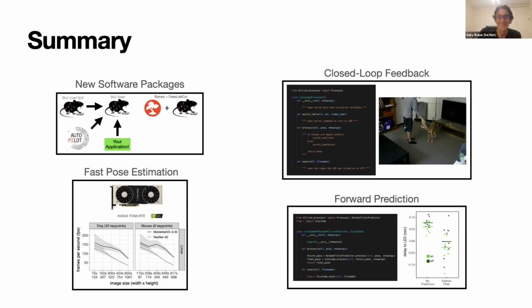So I guess it's almost like a little bit of a joke. The goal is to have zero latency feedback. You want to be triggering something exactly when the animal is exhibiting behavior, but there's a little bit of noise there. Also, in this experiment, we handicapped ourselves by using a $20 webcam and very cheap hardware. So we weren't super precise, and when we were shooting to get zero latency feedback, sometimes we were a little bit early.